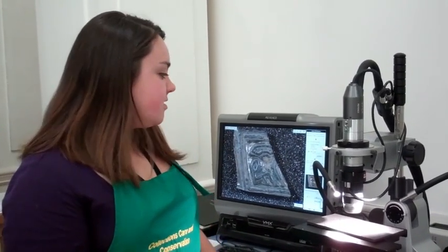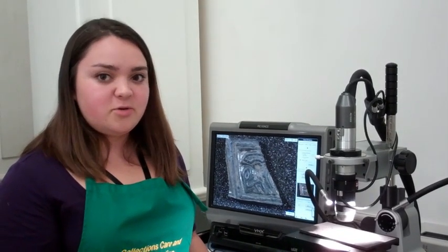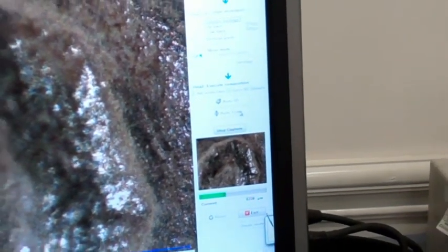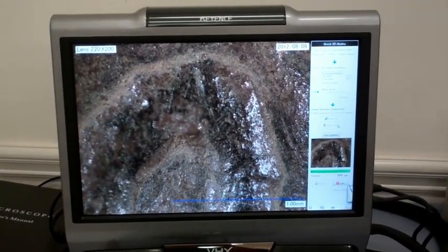We received a new microscope in the summer of 2011, and this microscope helps us take care of that focus issue because it can work in 3D. To fix this focus problem, we're going to stack photos with different levels of focus, so that after taking an image at certain intervals, it'll stitch together these photos and everything will be in focus. Perfect.